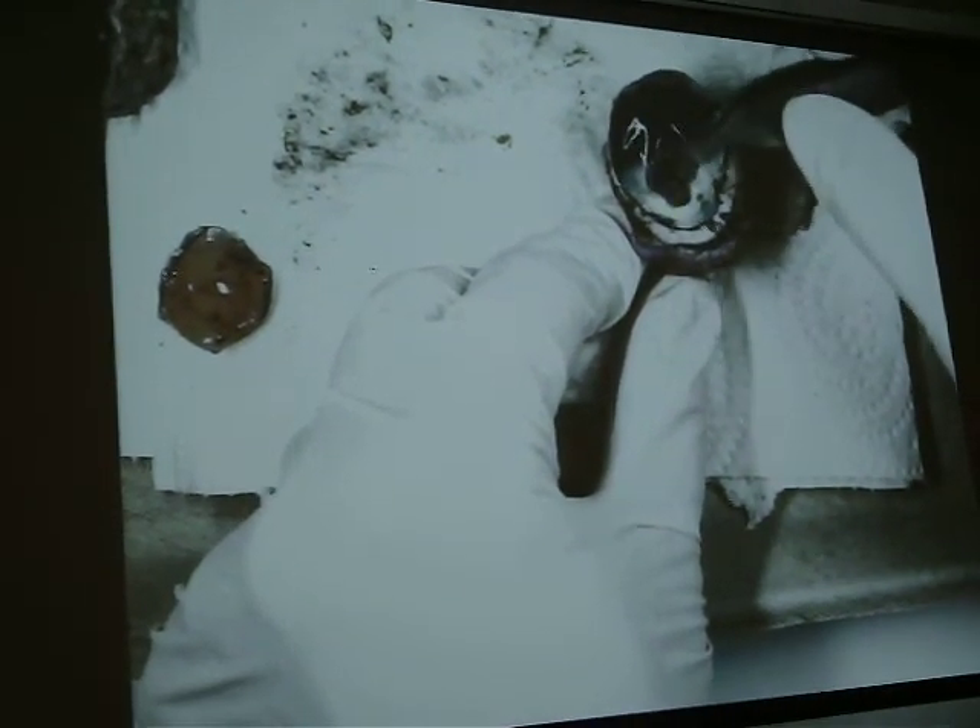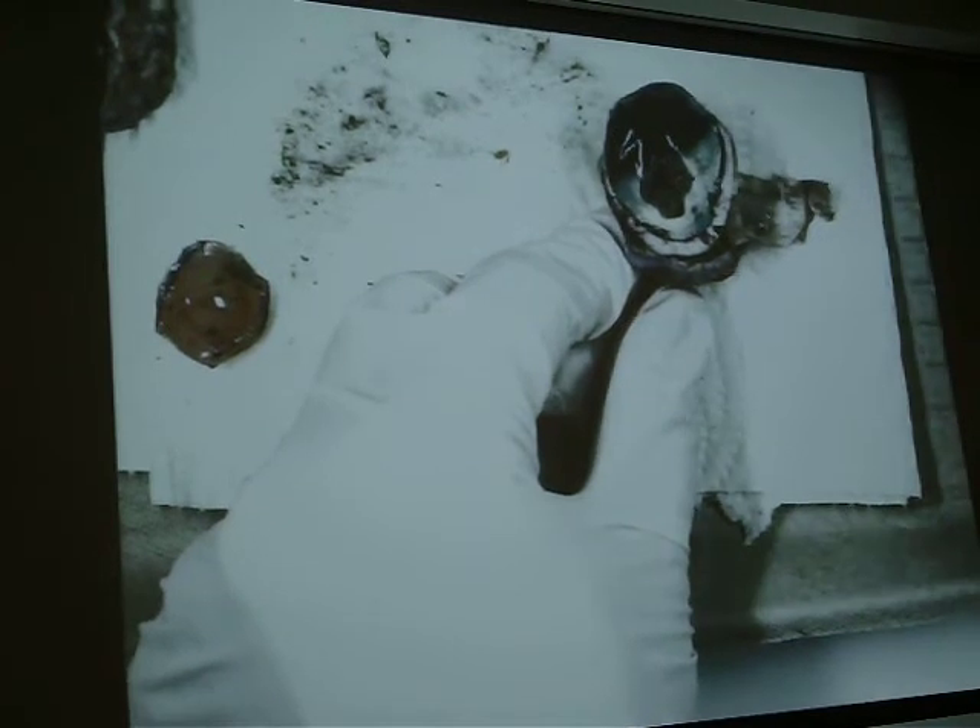It kind of looks like an abalone shell — a seashell. They don't know what an abalone is. They think it's like albino baloney or something.